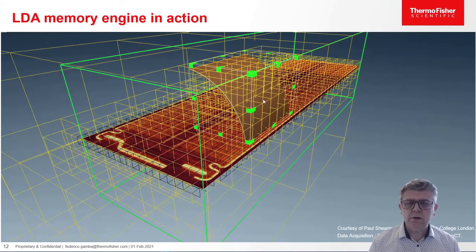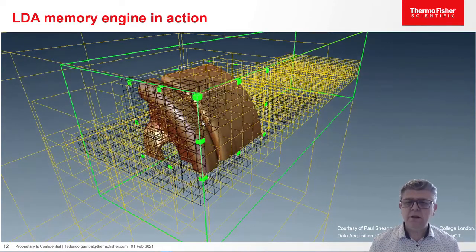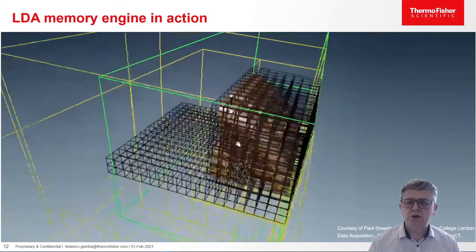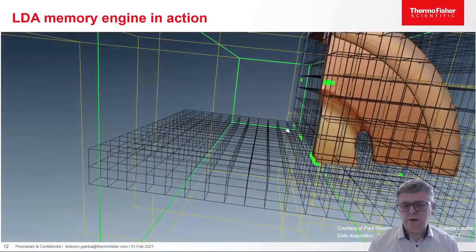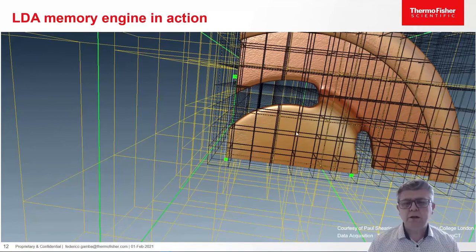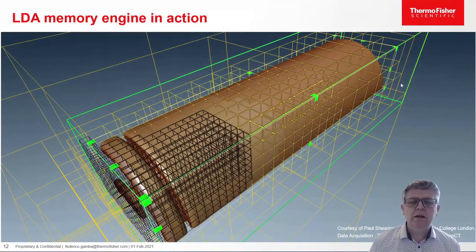For this video, this specific one, I choose very low memory, maybe 5 gig or less. So the idea is that you can see how the LDA reacts to the movement of the camera and to the changes. Like I remove the slices, now all memory is devoted to volume rendering, and the volume rendering is not so big. And now I increase a bit more with the ROI box for volume rendering. Still I'm in full resolution here because the black boxes are the full resolution ones, okay? And the yellow are the lower resolution.